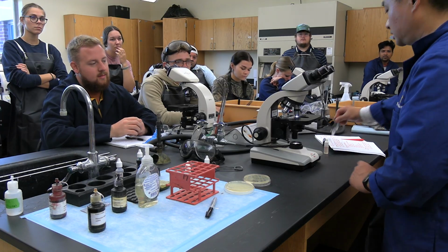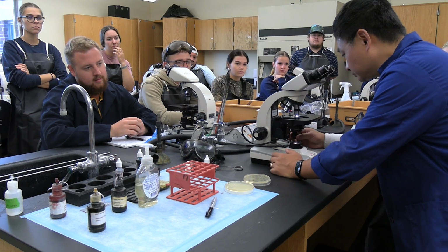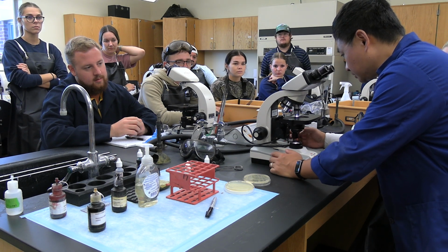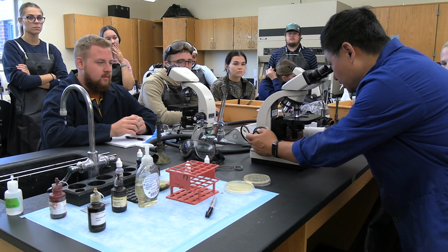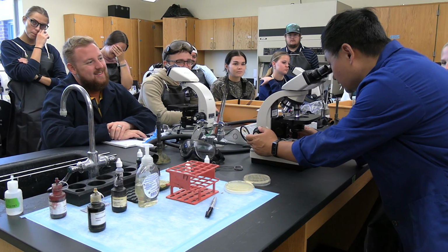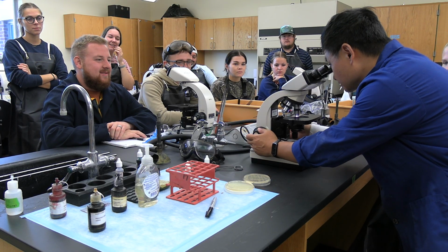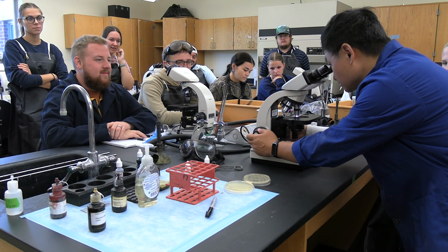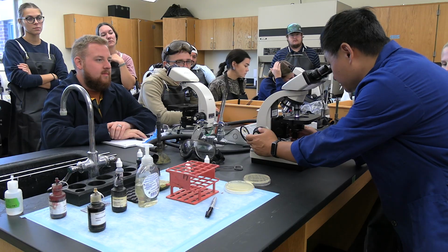Now, we'll just take advantage. Let's just move in to see what it looks like. Okay, I'll move. Sometimes it works, sometimes it doesn't work. Oh, we got lucky, so it works. I'm going to find a good area, where you can see some of the pink color there.